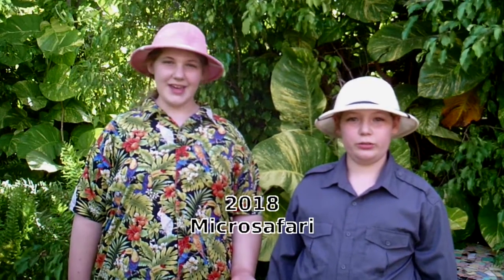This is a video of our 2018 Microsafari. In our Microsafari, we will try to meet some of the cute little creatures living in fetid waters around us. We will then explore the parts of the cell and their functions.